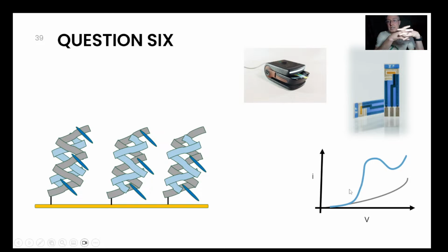So if you are building a molecular assay and you want a simple way of doing it, I'm not a great fan of gold. I quite like carbon, but you can do self-assembled monolayers on gold, or you can use a molecule called pyrene NHS on carbon to activate your surface, and then you can attach your capture RNA or DNA to that surface. Having done that, when you add your target, they should hybridize.